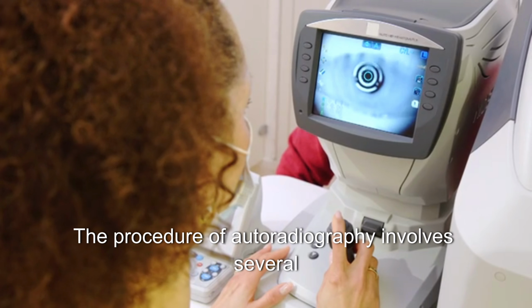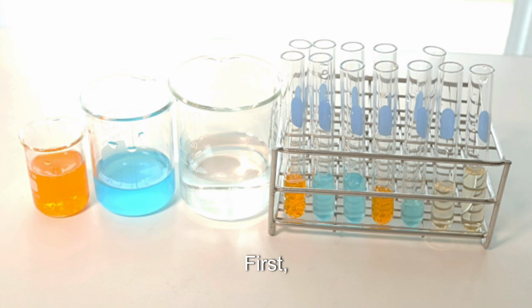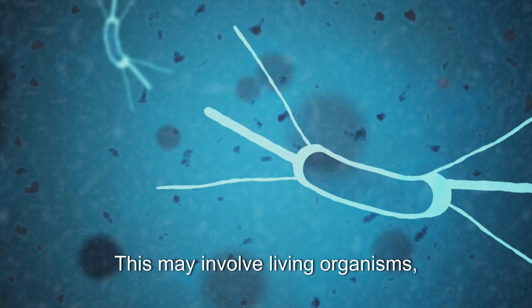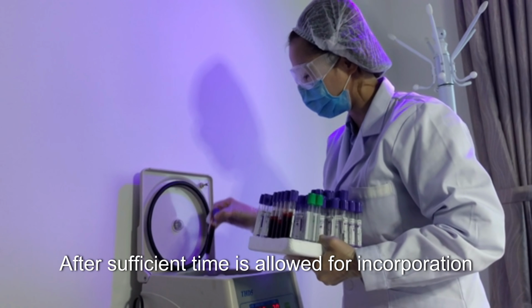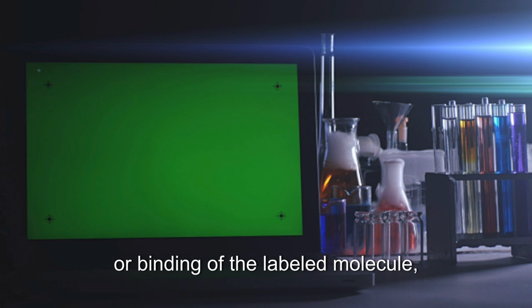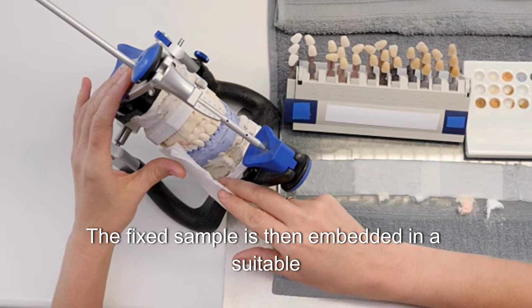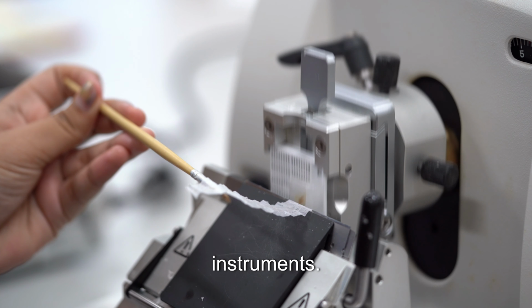The procedure of autoradiography involves several carefully controlled steps. First, the biological system is exposed to a radio-labeled compound. This may involve living organisms, cultured cells, or isolated tissues. After sufficient time is allowed for incorporation or binding of the labeled molecule, the sample is fixed to preserve its structure. The fixed sample is then embedded in a suitable medium and cut into very thin sections using specialized instruments.